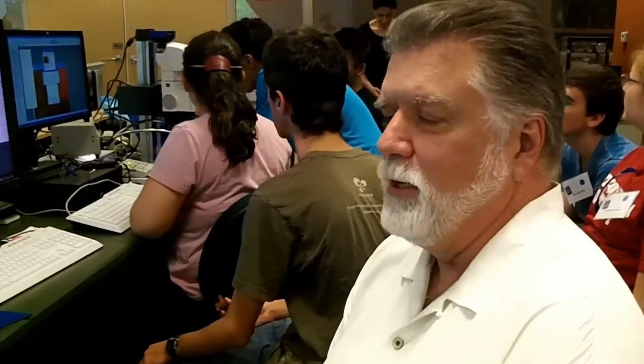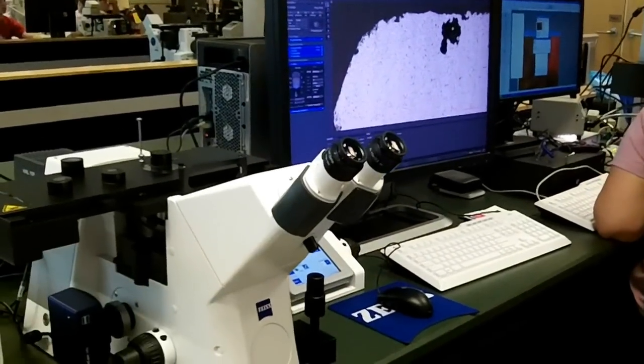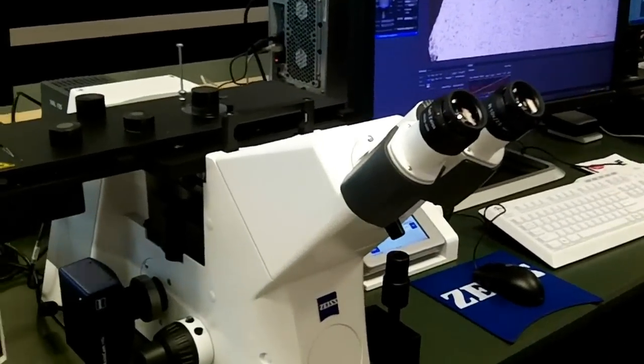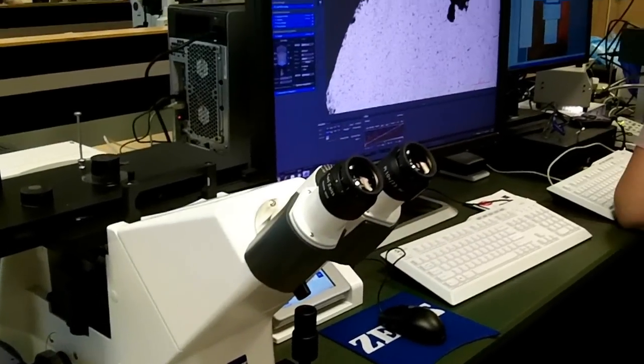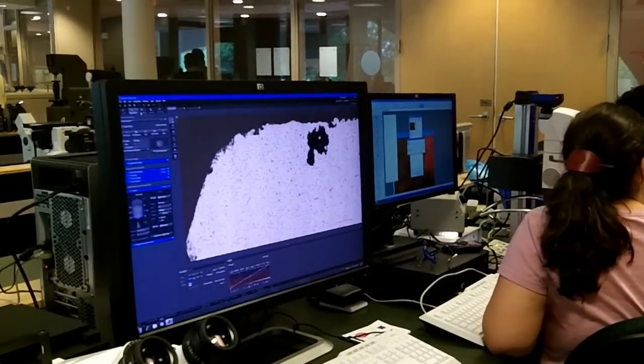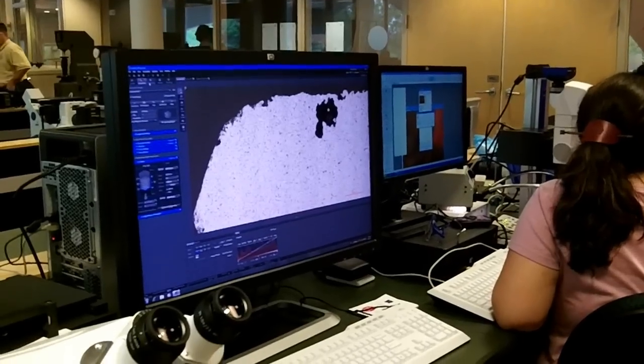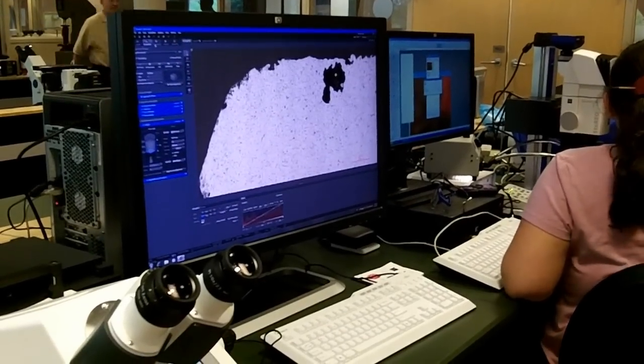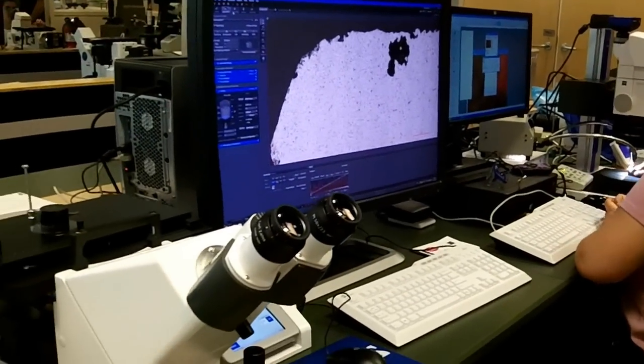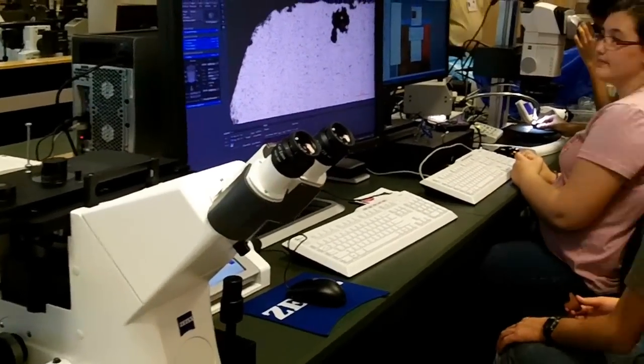Good afternoon. I'm Tom Henderson, and today we have our Axio Observer Z1, which is an inverted automated metallogram, and our AxioCam HRC color camera with our image analysis program called ZEN. Today what we're going to do is be looking at the microstructures of different samples so the students can identify where the failures are coming from.